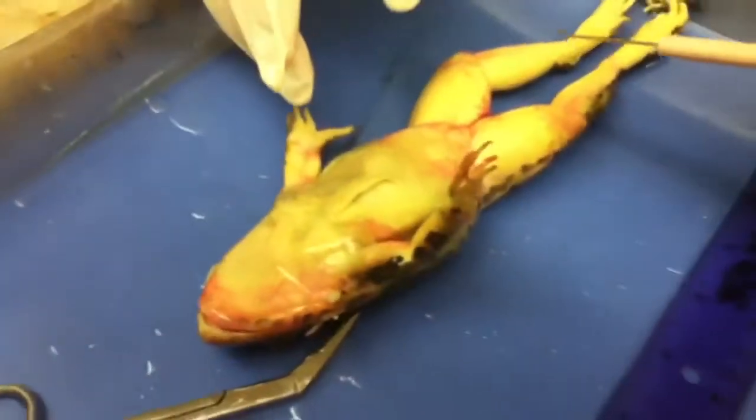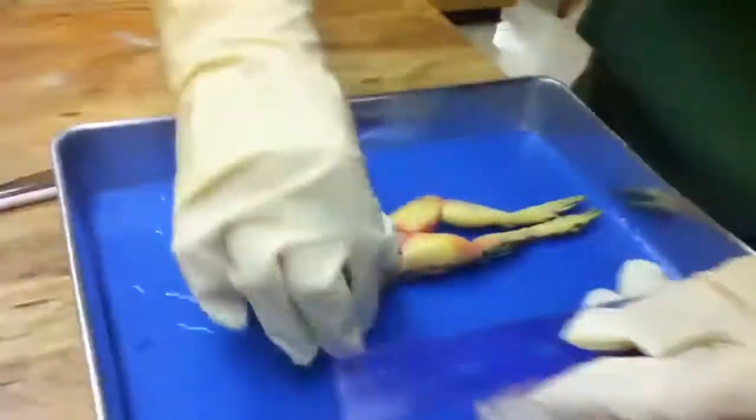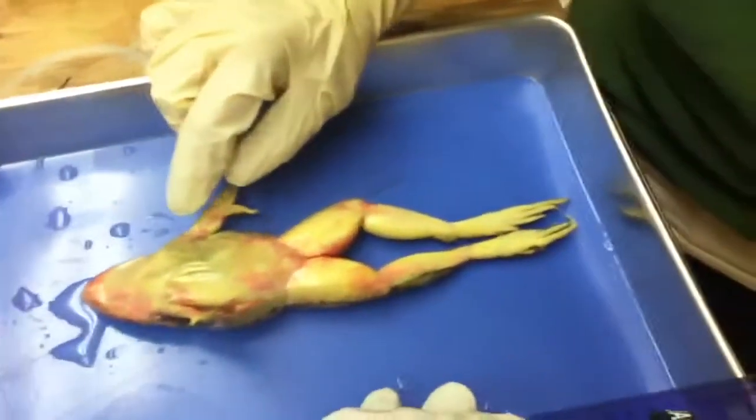What is the length of the front legs? The frog legs, just his back legs. The front legs. Centimeter wise? His legs are uneven.